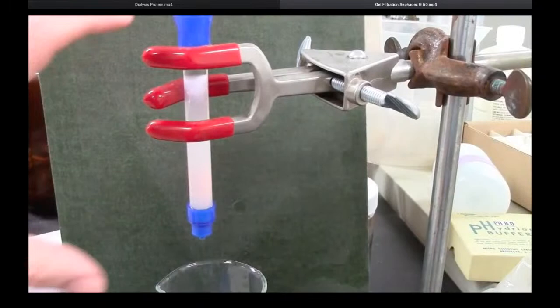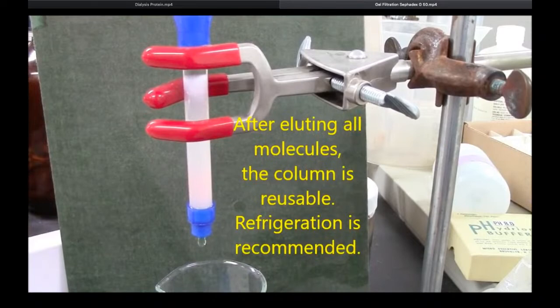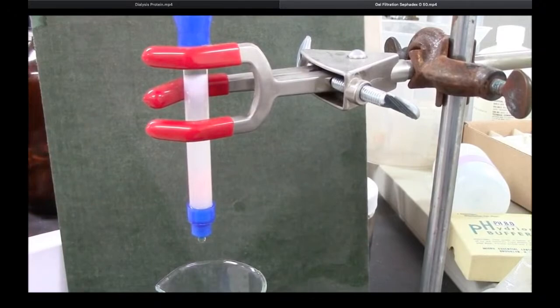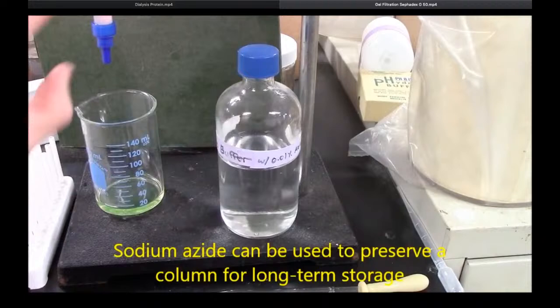It's reusable. Sometimes microorganisms like to grow in the Sephadex, so if you want to preserve your column for a long period, keep it in the fridge, certainly. And sometimes azide is added to the buffer to prevent growth of microorganisms. Here's Tris buffer with 0.01% sodium azide, and this will prevent microorganisms from chewing on the dextran that's in the column if you're storing it over a long period of time.